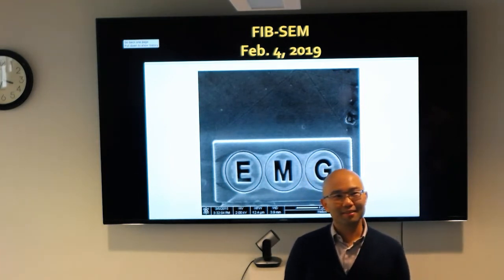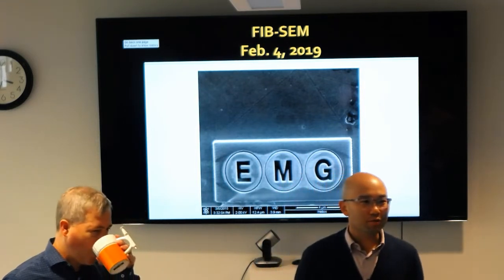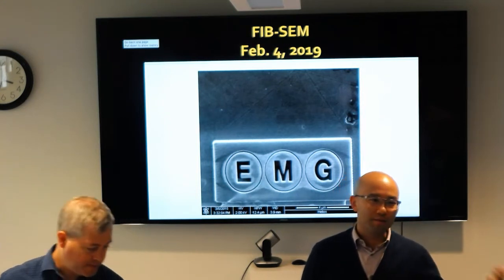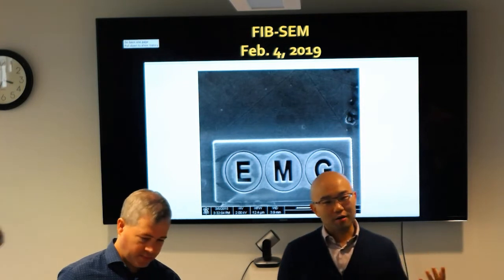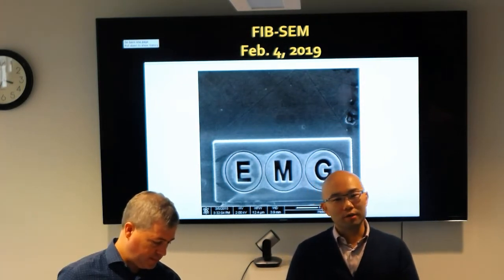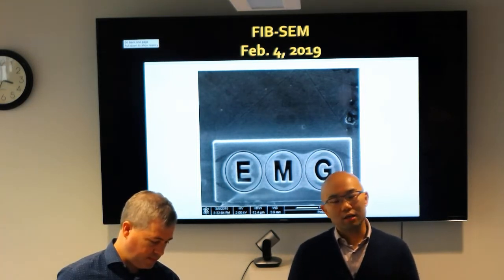Good to go? Good. Okay, well, good afternoon and welcome to the Simons Electron Microscopy Center's Winter EM course. We are well into our tomography section. You heard a lot last week from Wei Dai about traditional methods for tomography. Now we're going to be talking a little bit about the other instrument that we touched upon, and that's the scanning electron microscope.